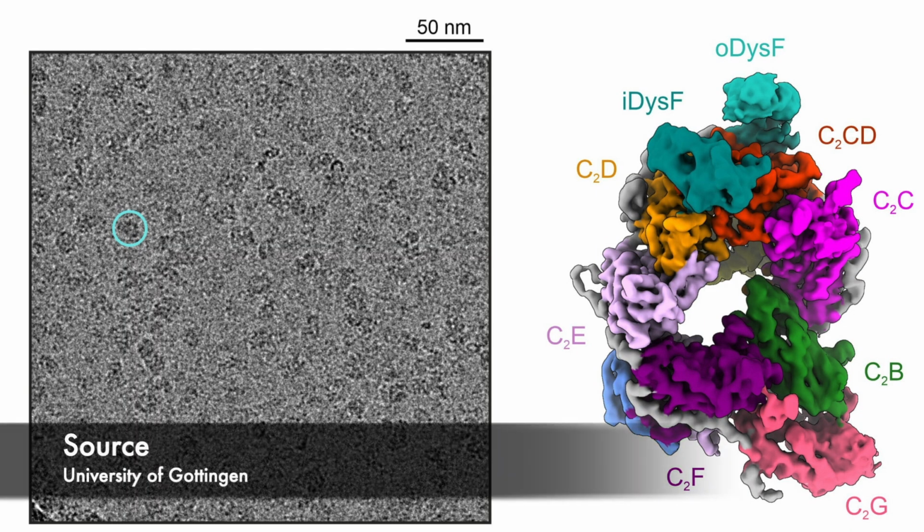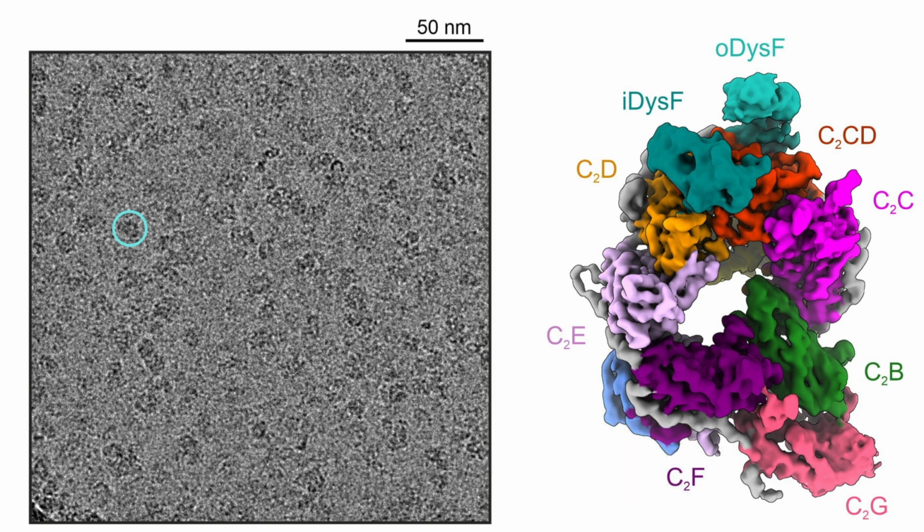And then here we are looking at what a raw image from an electron microscope would look like. This is not an image that I took, but it gives you the sense of it. As you'd expect, it doesn't look that sensational. There's only black and white, but you can actually spot individual proteins at this level, which is really sick. As you can see in the image here, I don't know what this protein or structure is, but you can see the blue circled thing in the raw image, that's supposed to be this structure on the right.